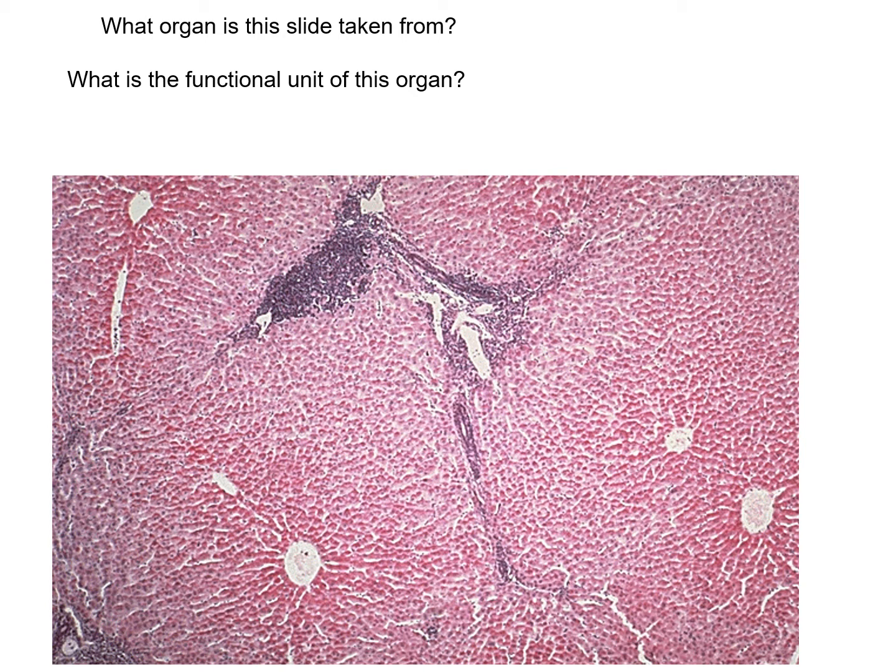The lobules of the kidney? It is not kidney. The pancreas? No. Is this the liver? It's the liver. Yeah. Oh, lobules. And lobules are the functional unit, yes.